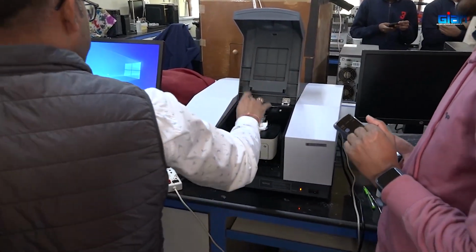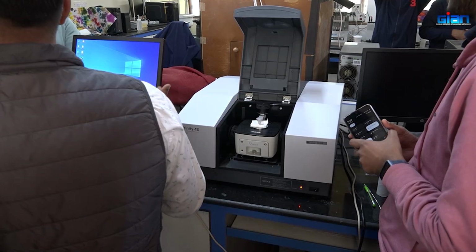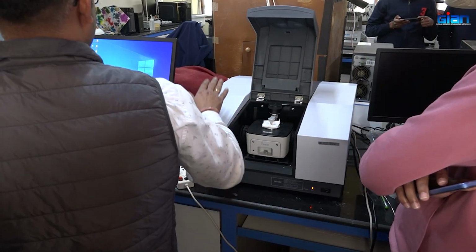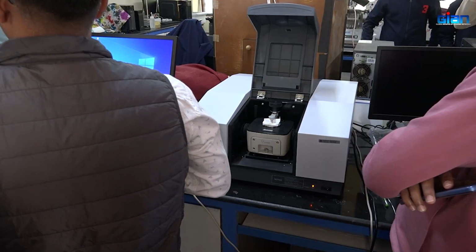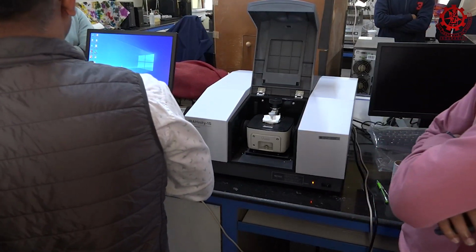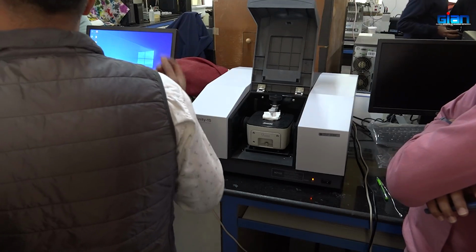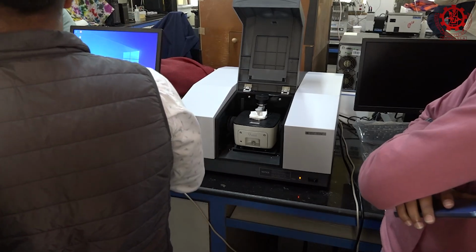Now we put the sample here, and everything else like the source which will give infrared, because again I will be talking about the principle of this one. This is based on infrared electromagnetic radiation. You know electromagnetic radiation, like the one we see, which radiation is this? This is visible, right? Besides this visible region, there are several others, starting from gamma ray, X-ray, ultraviolet ray, then visible, then infrared, microwave, radio wave, and so on.